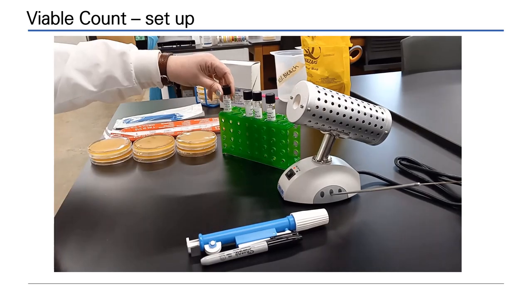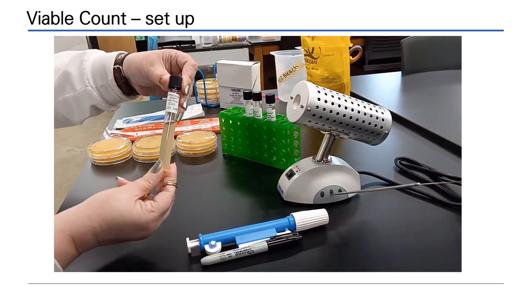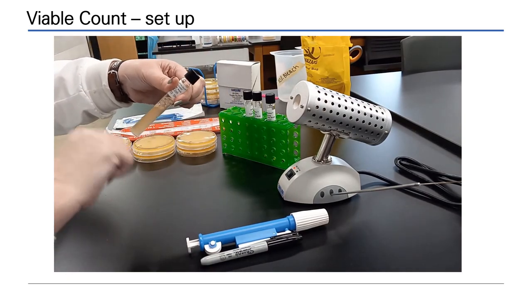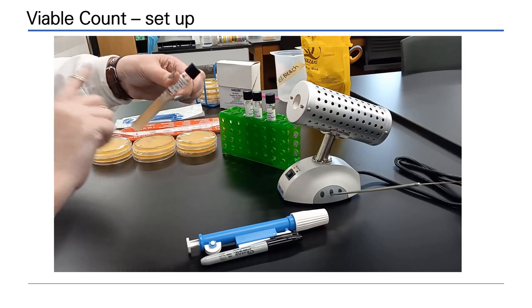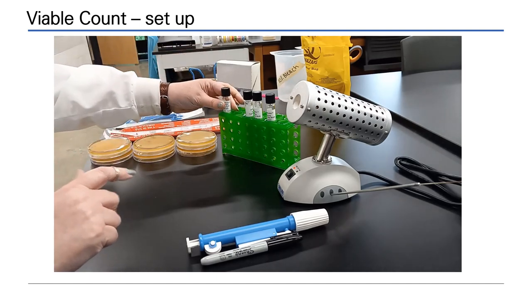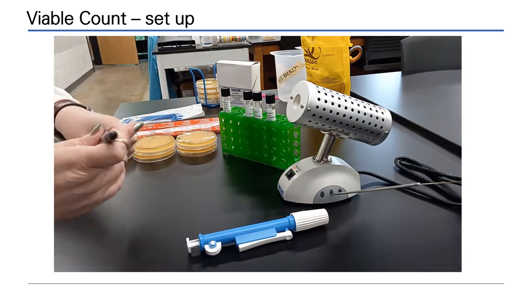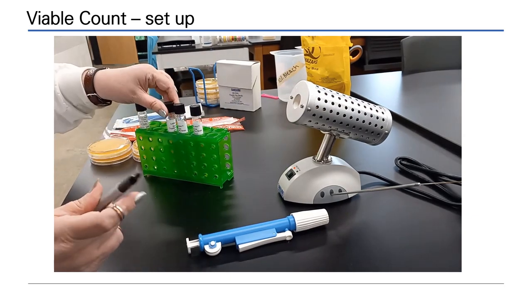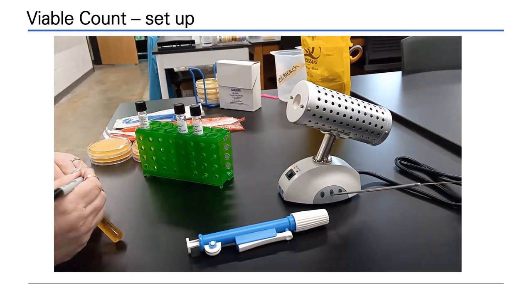The viable count technique is a means to determine how many live cells are in this culture. Cells must be re-suspended before diluting them. In this demonstration, a serial dilution, which is 10-fold, will be performed.